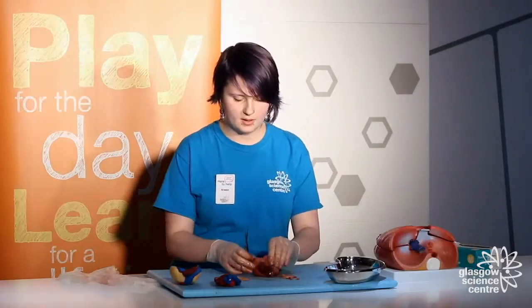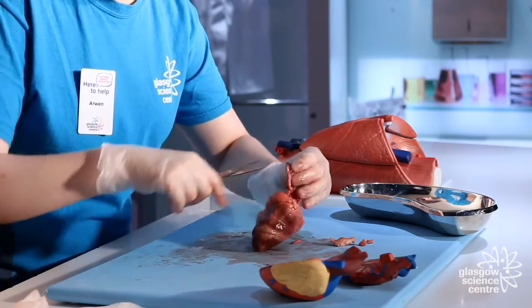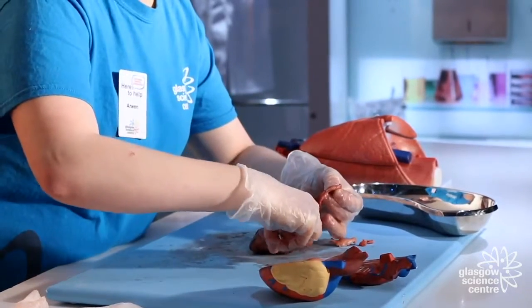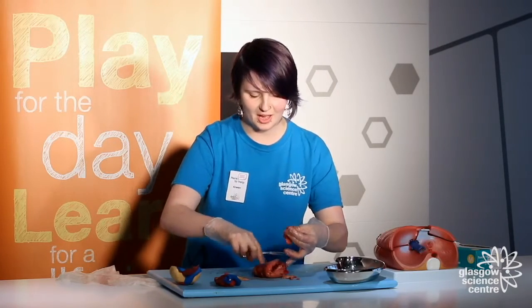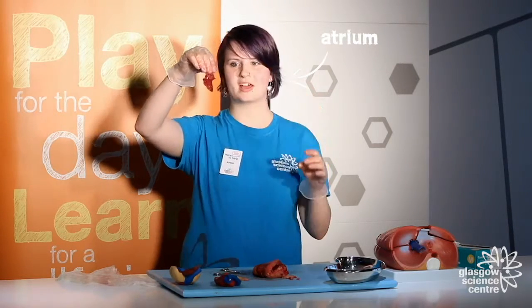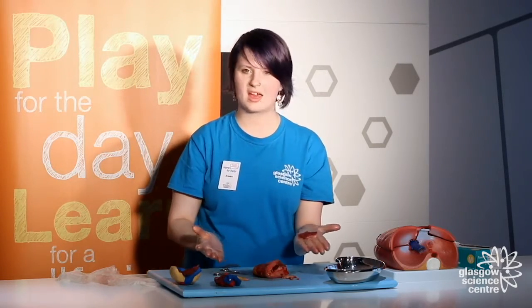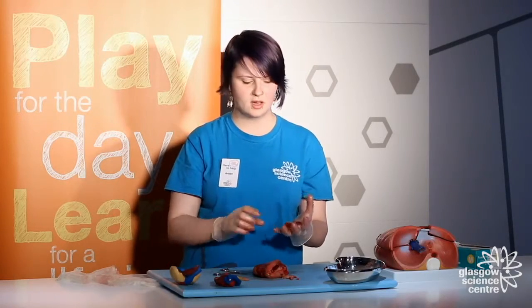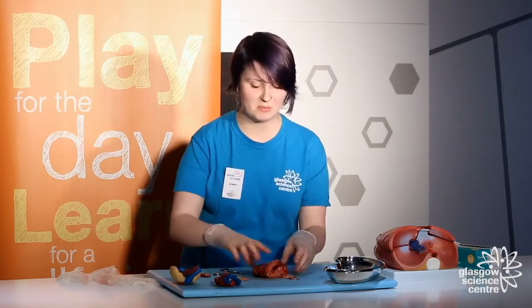I'm going to start by cutting off our right atrium so we can have a look at the inside of it. I'm always amazed at how small it is — that's the atrium there. Light can even shine through it, that's how thin it is. If you look carefully at the structure, it looks a little bit like a tree, which I think is quite cool. This is to stop the force of blood so it doesn't break when it comes in, in case of high blood pressure, like if you've been running around.